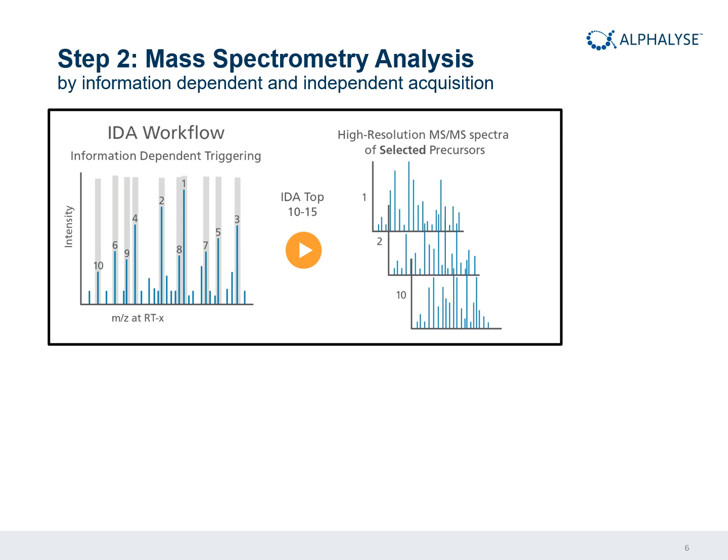This works quite well for most abundant peptides, but if you have less abundant ones, and those are the ones we typically have for host cell proteins, then the instrument might not select the same set of peptides. Even if you run the same sample twice, you might get two different data sets, especially with the low abundant peptides. And this is not very good when we need something that is robust and reliable.